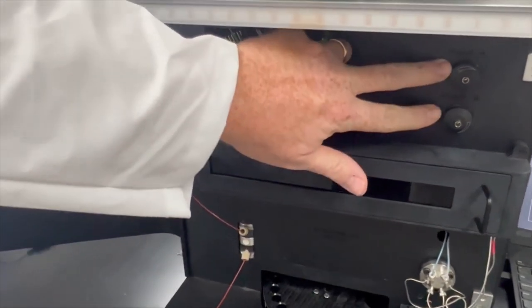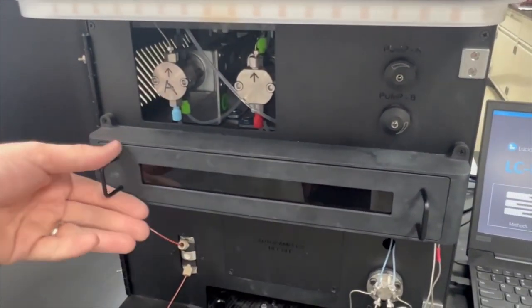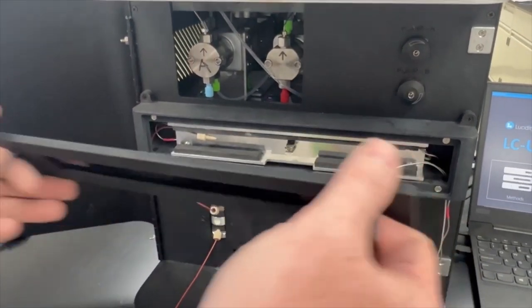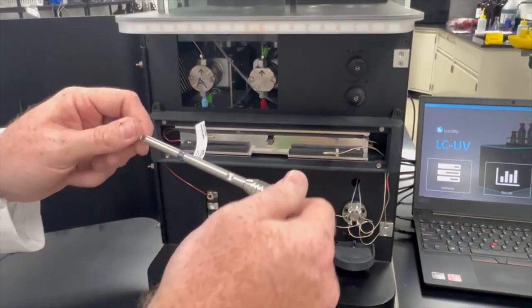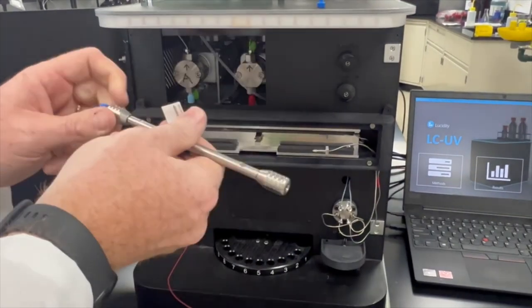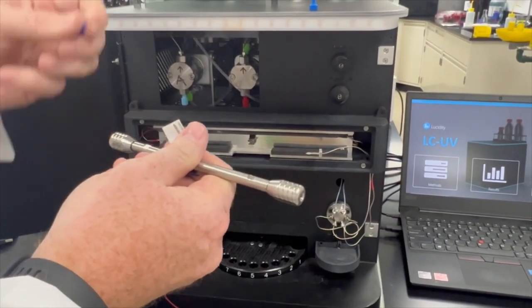We have our pumps, purge valves, and column oven. We're going to connect our column, so we'll remove our blank nuts here and save those for later.